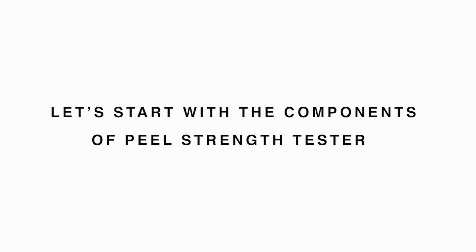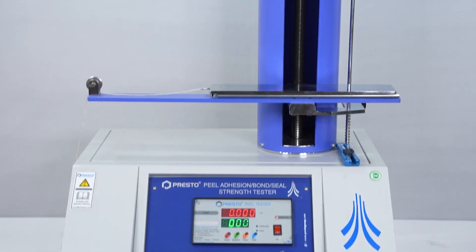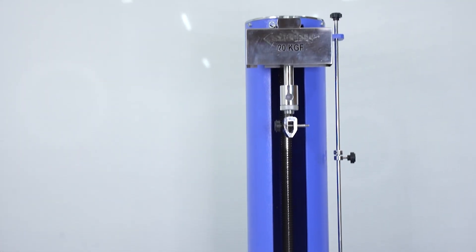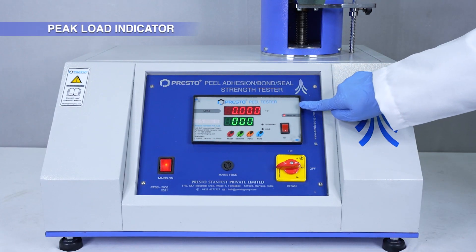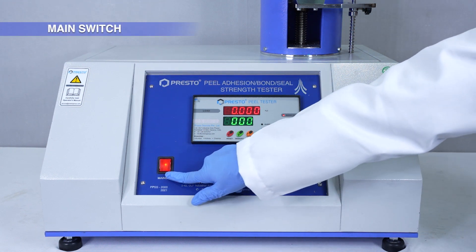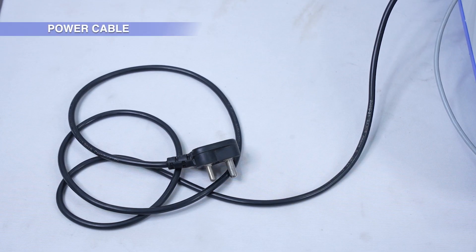Let's start with the components of the Peel Strength Tester. The unit has a maximum capacity of 20 KGF, a Peak Load Indicator, a Main Switch, an RS-232 Cable, and a Power Cable.